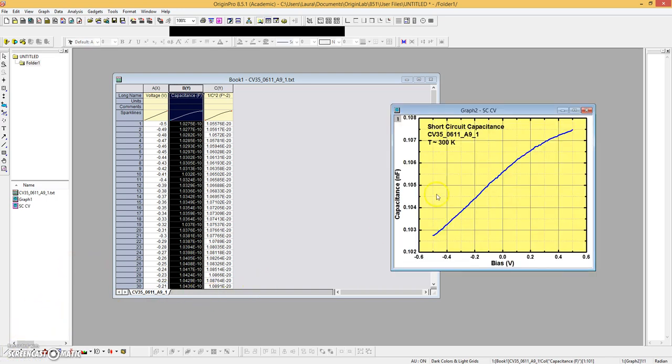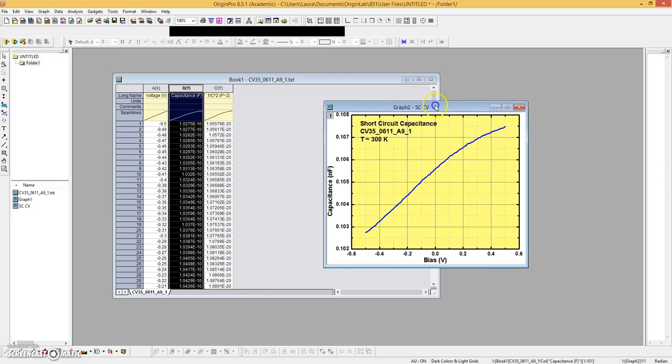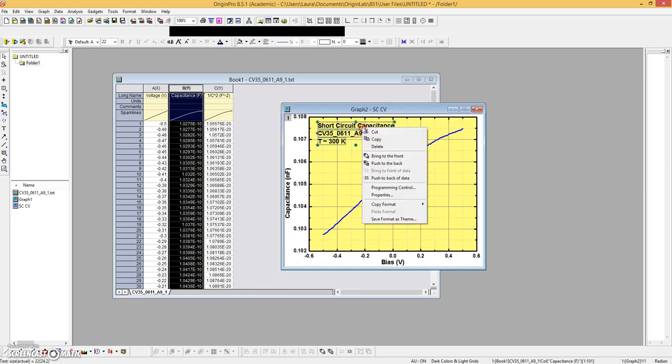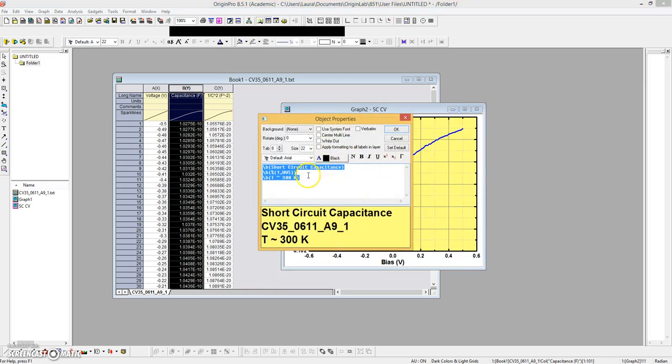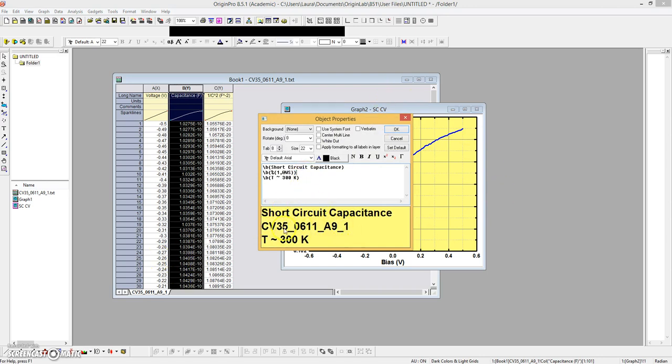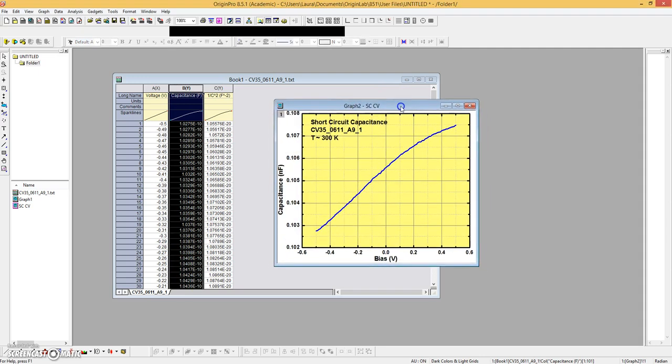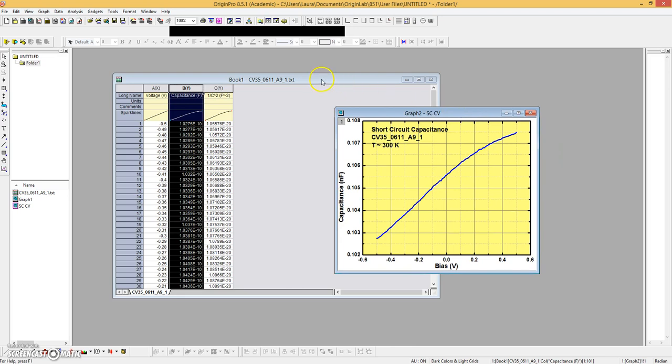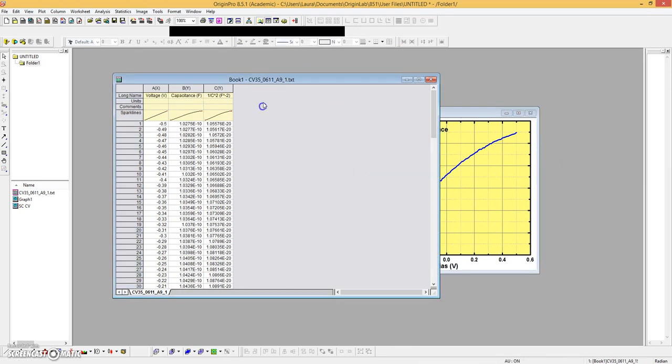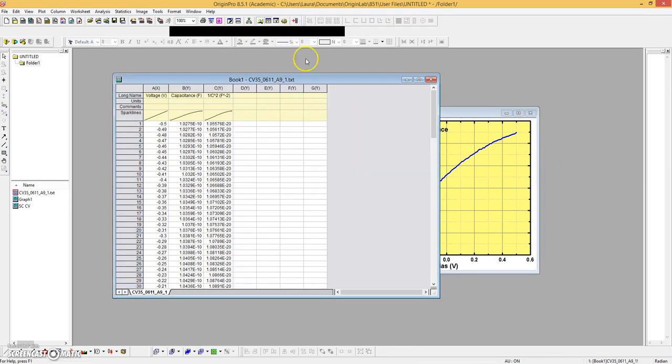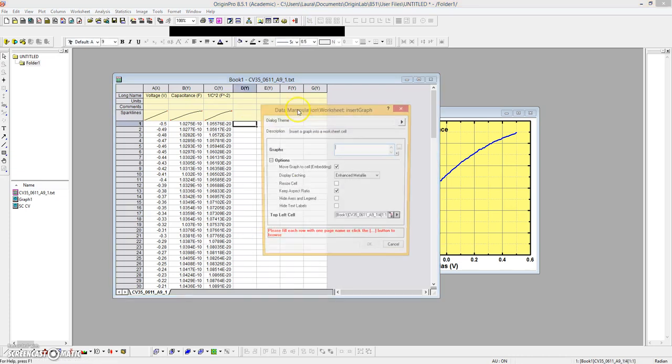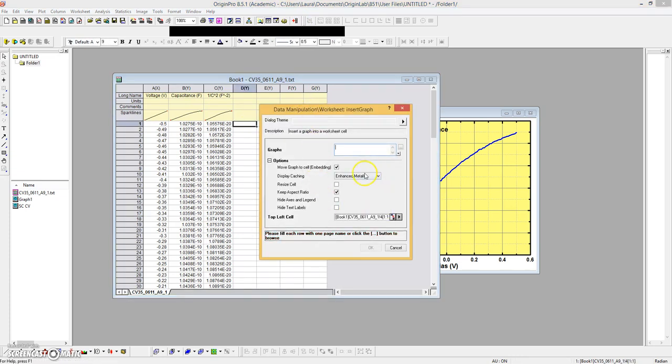And we're back! Okay, I made this a little prettier. I also linked this middle line to the worksheet title so we know which part and device we're doing stuff on. So now we have this graph and this workbook. Let's add a few columns, and we can insert this graph into the actual workbook to make our folder a little neater.